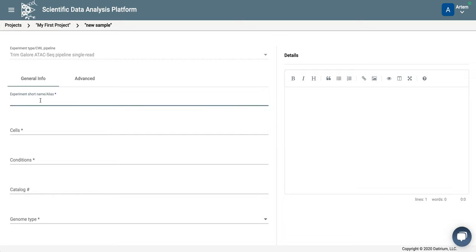We add experiment short name, and in this case, we are going to add data from our recent paper. So we are going to GEO.